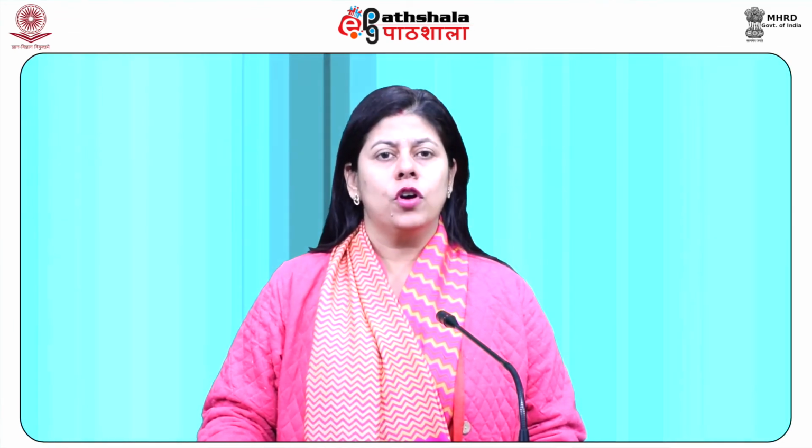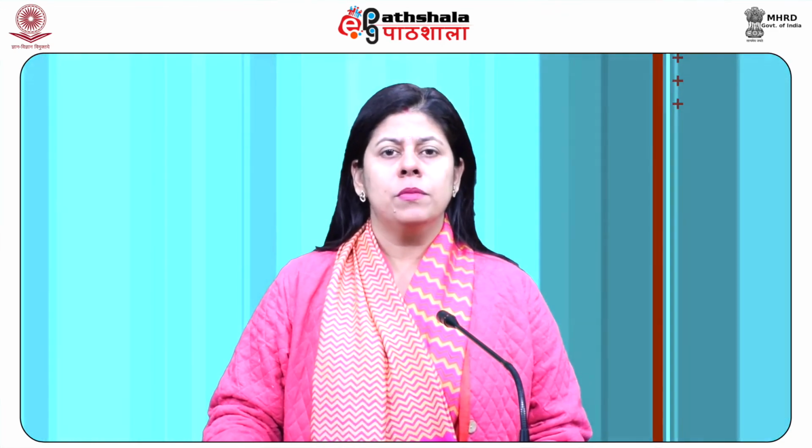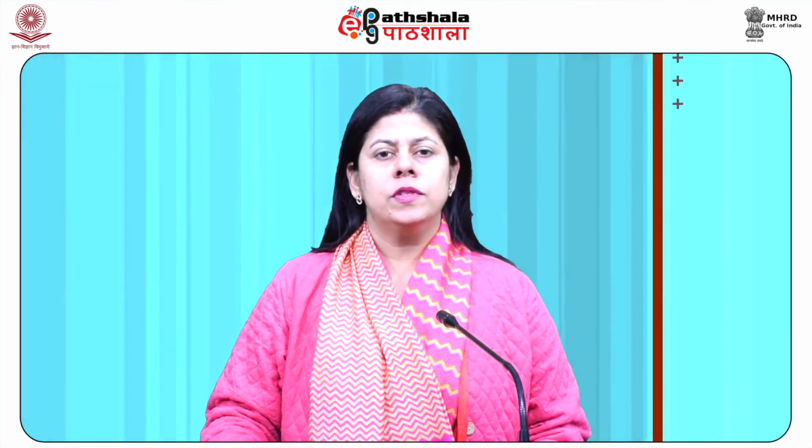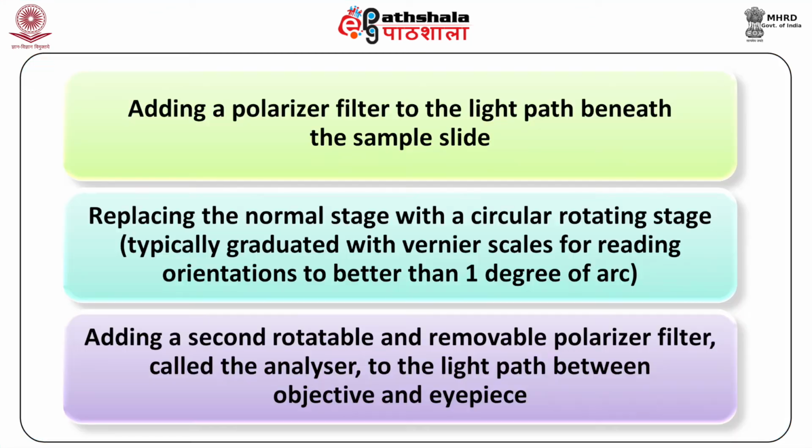Depending on the grade of observation required, petrological microscopes are derived from conventional bright field microscopes of similar basic capabilities by adding a polarizer filter to the light path beneath the sample, replacing the normal stage with a circular rotating stage typically graduated with a vernier scale for reading orientations to better than 1 degree of arc, and adding a second rotatable and removable polarizer filter called the analyzer to the light path between objective and eyepiece.